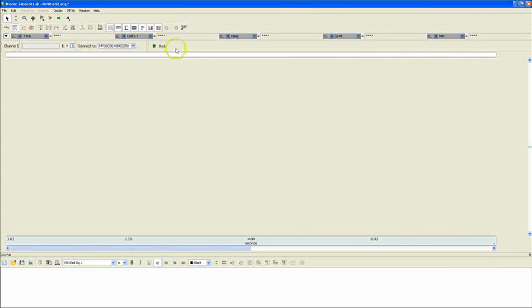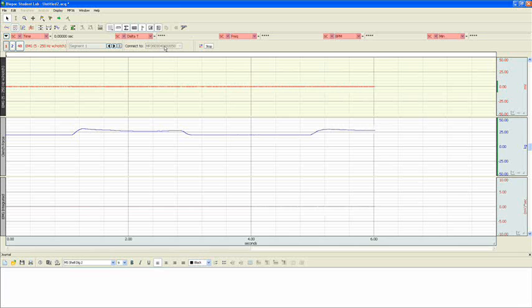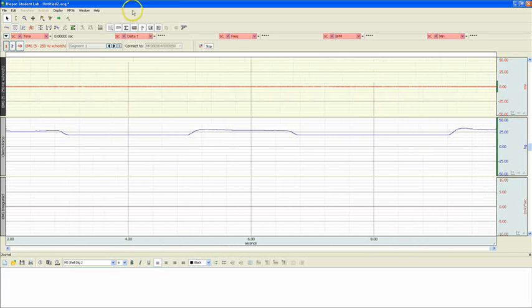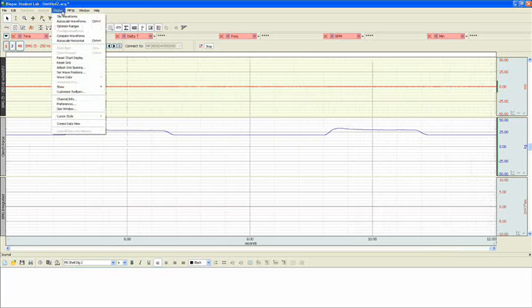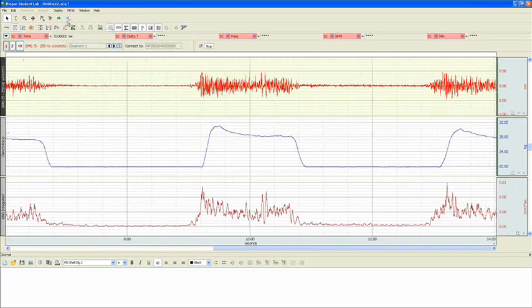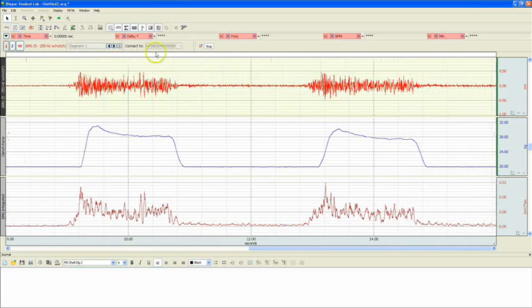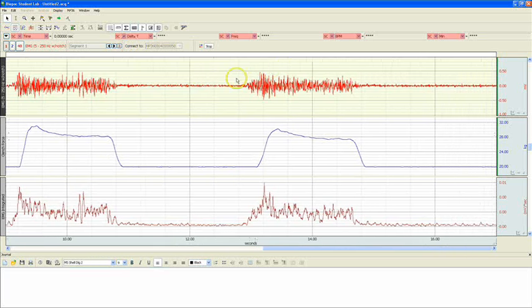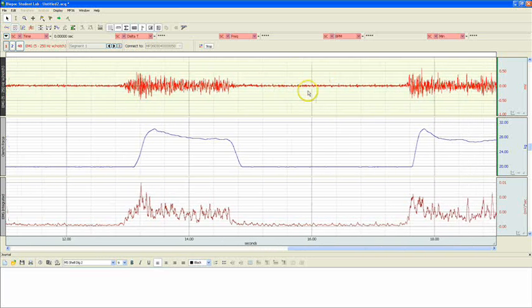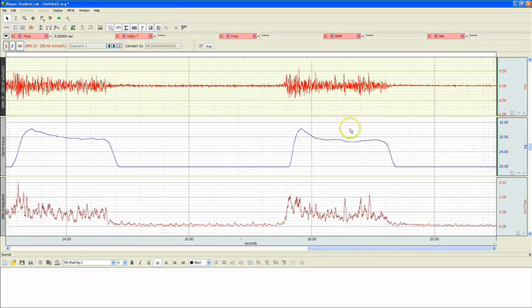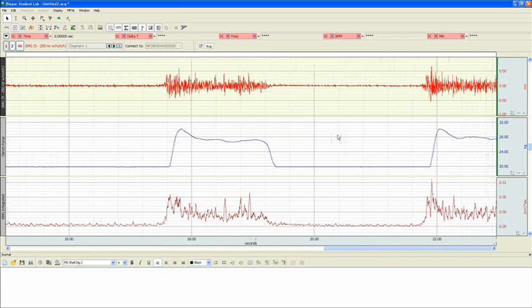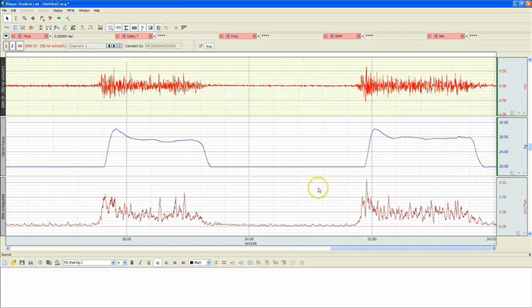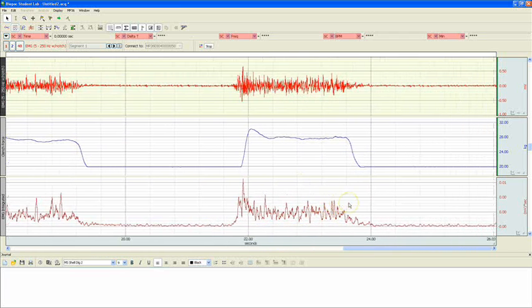I'm going to click on Start and record a few clenches. Now you can see the data being recorded, but you'll see that it is not scaled optimally for our window. To fix this, we can go up to the Display menu, and click on Autoscale Waveforms. Now, you'll see our raw EMG on the first channel, our clench force on the second channel, and the integrated EMG on the third channel.